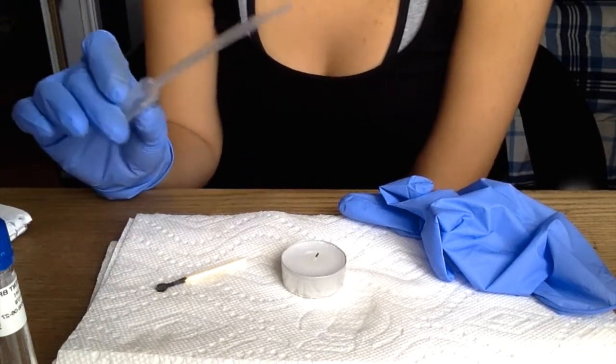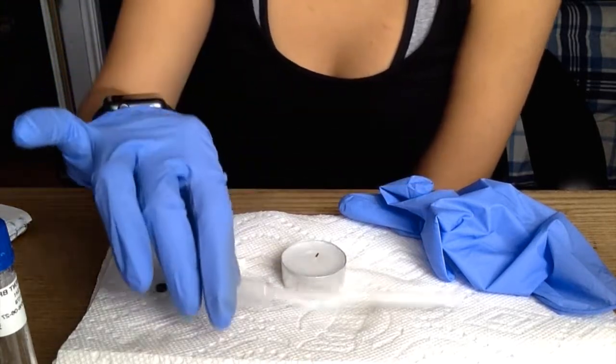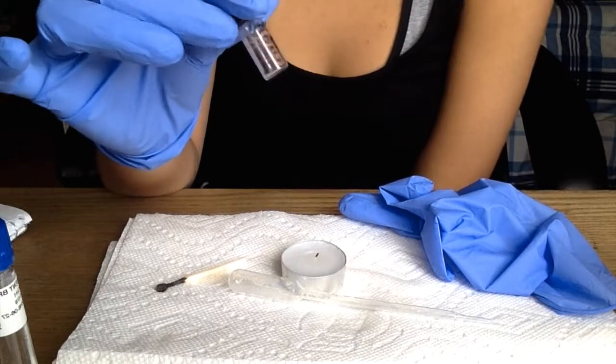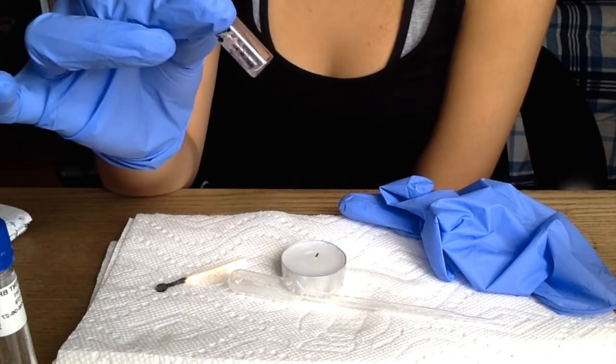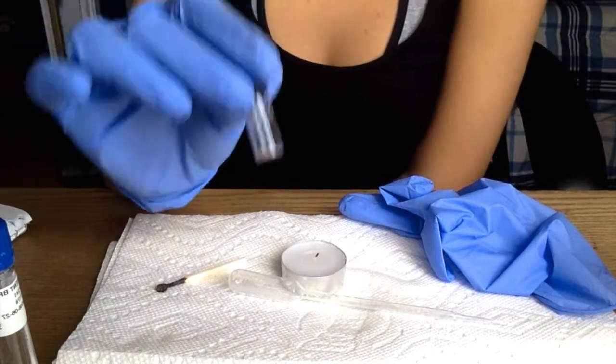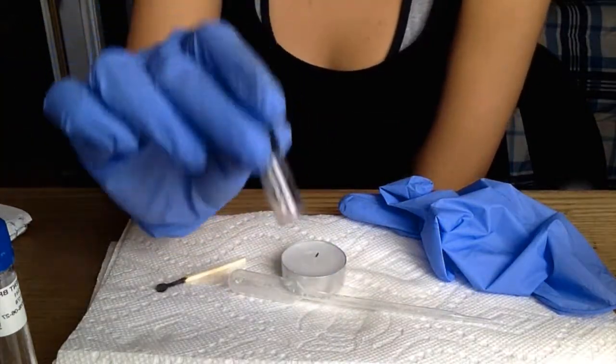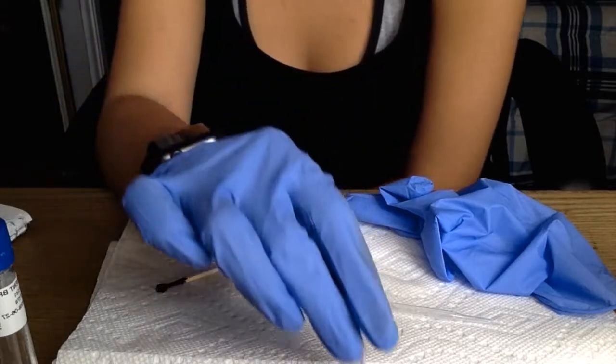So basically what I did was, after sterilizing this pipette and sterilizing both the lip of the nutrient broth and the E. coli, I went ahead and I put 0.25 milliliters of the nutrient broth inside of the vial containing the E. coli culture. After that, I shook it until the whole tablet dissolved.